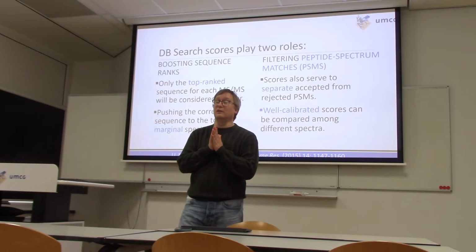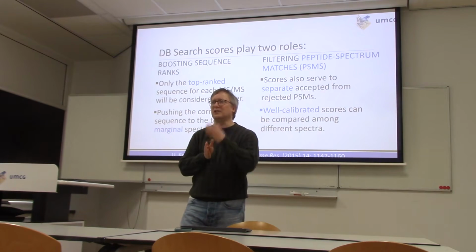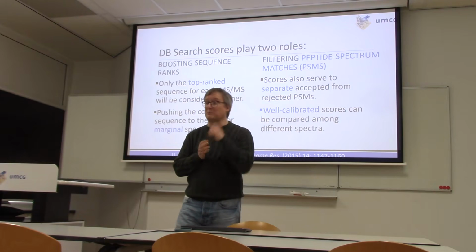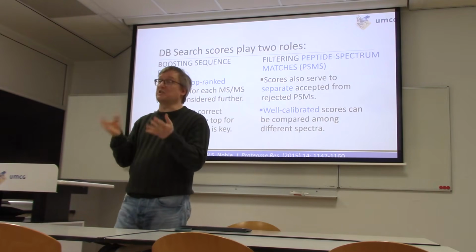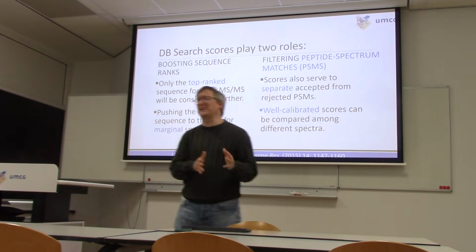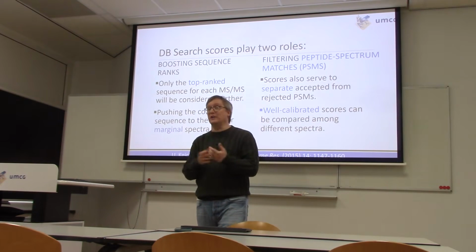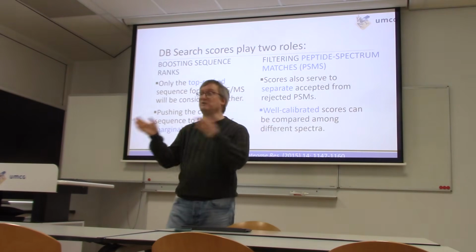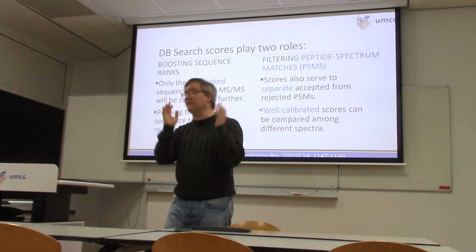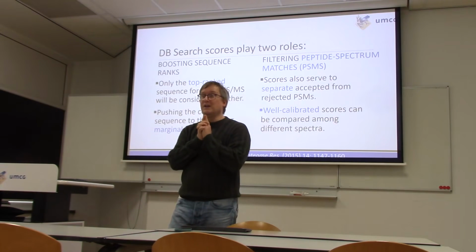So, if you think of the first part as the essentials of how we identify stuff, there's still a lot of work left to do, because remember, most of the biologists sending samples to the core facility are not actually interested in peptides at all. They're interested in proteins. So we need to be able to talk then about how we get to protein level information, confident protein level identification information, and how we quantify them.